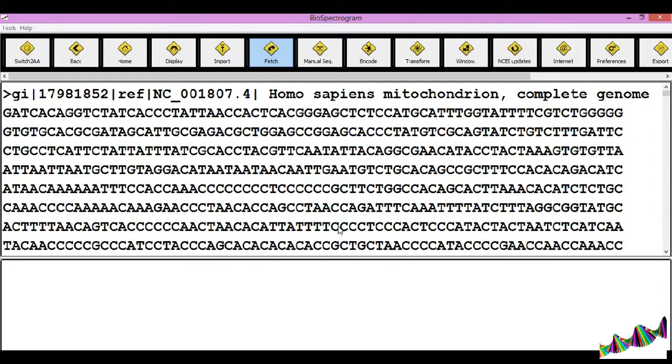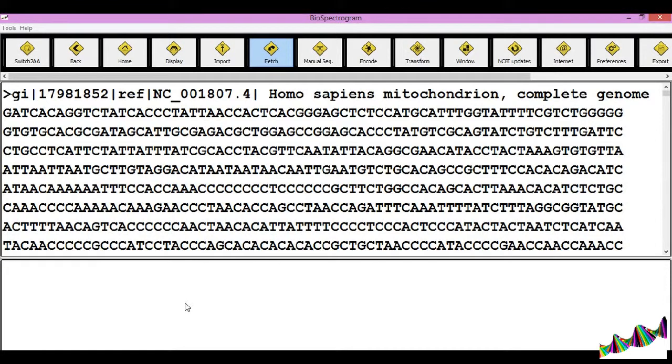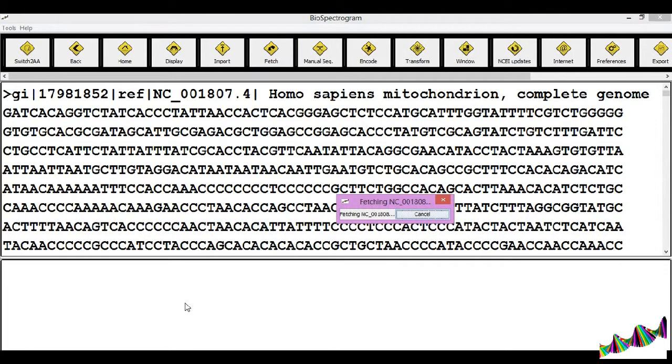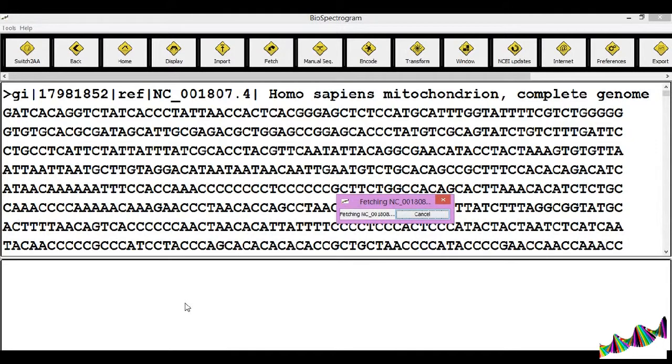The fetching is done from the NCBI's entries. As the fetching is done, this will display a fetching dialog box showing the progress of the file being fetched.